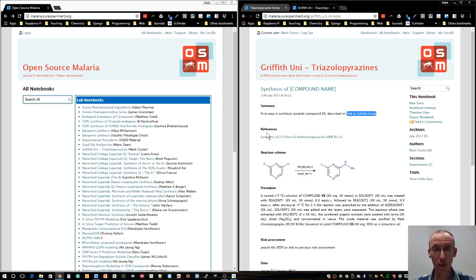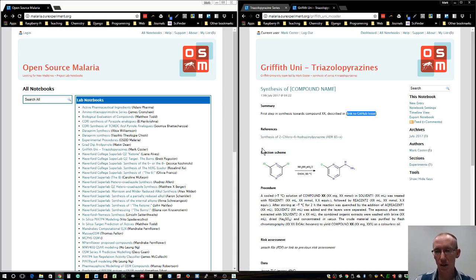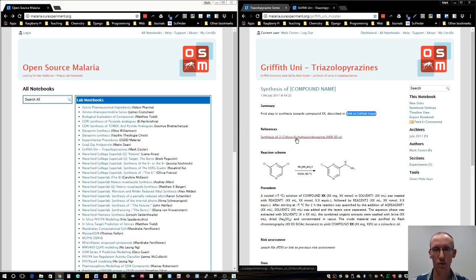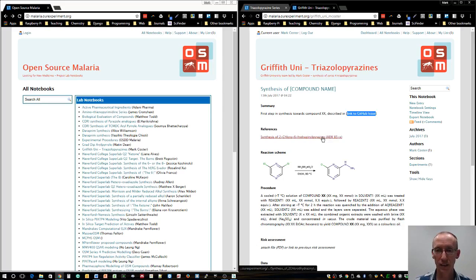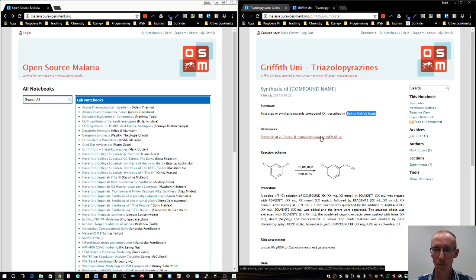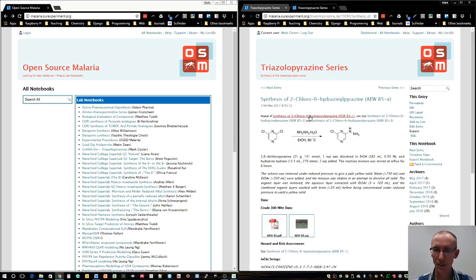You can provide a reference in ACS style to a journal article, or a URL to any web resource, or a link to a file. It's very easy to link to other electronic lab notebook entries, which is really nice. If we click on this it will take us to Alice Williamson's synthesis of this particular compound.